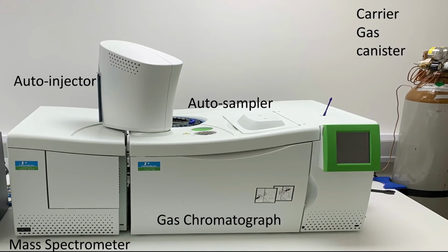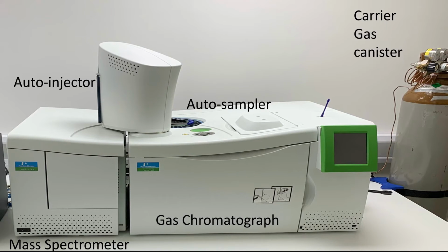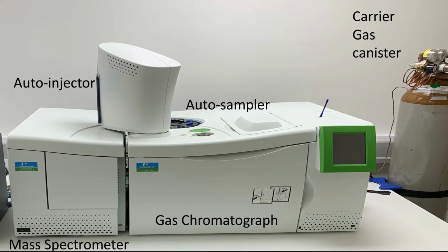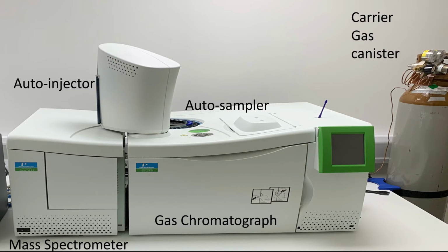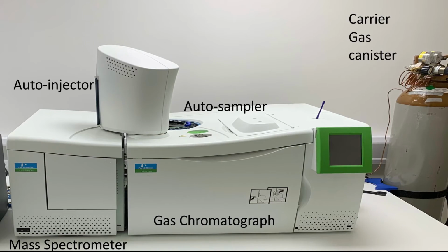This machine here is the GCMS, and as you can see by the labels, there are many different parts of this machine. Each component of this machine has a very different reason for being there. First, we're going to look at the carrier gas canister, which normally contains a gas like argon, helium, or hydrogen, normally an inert gas.